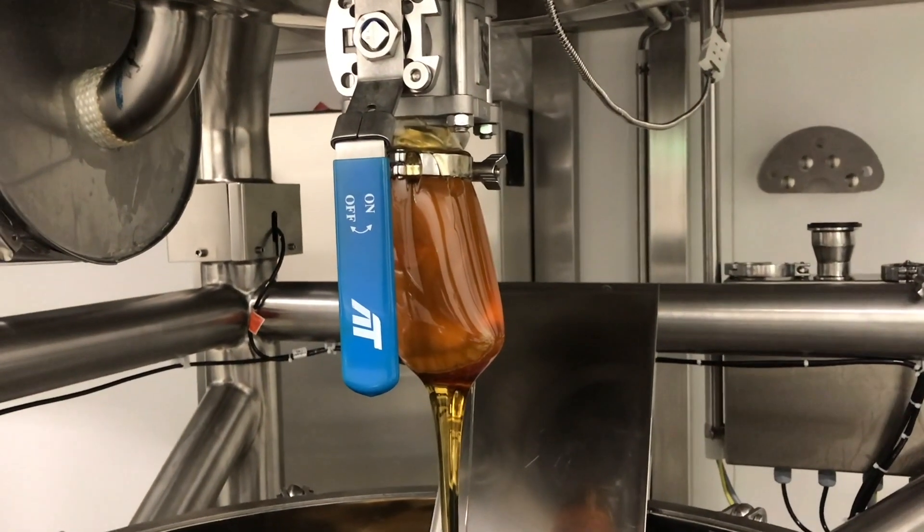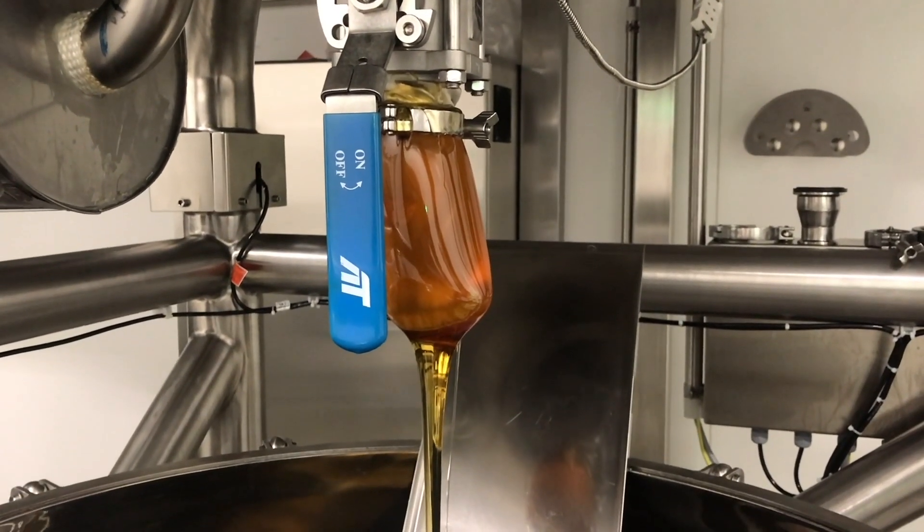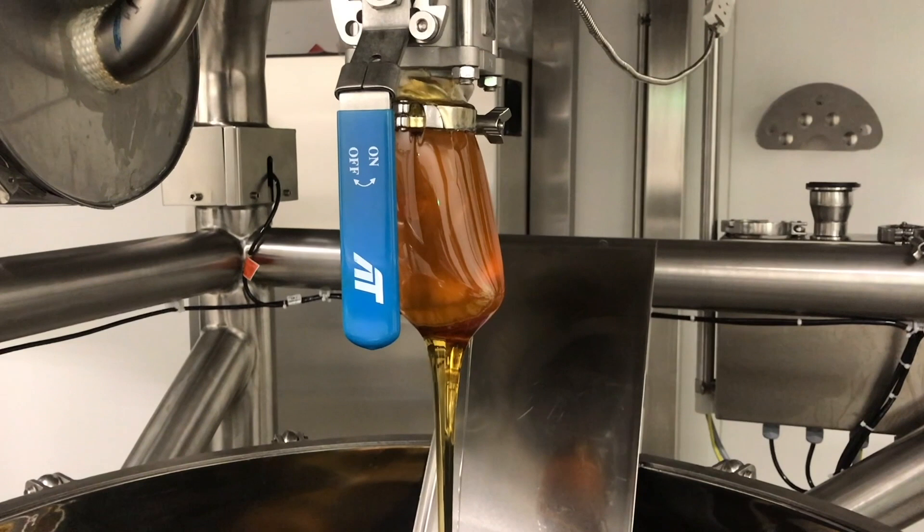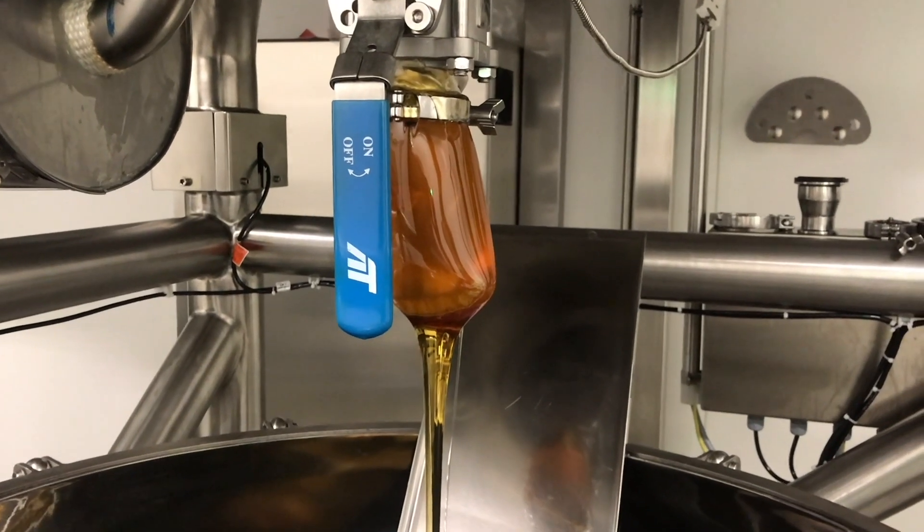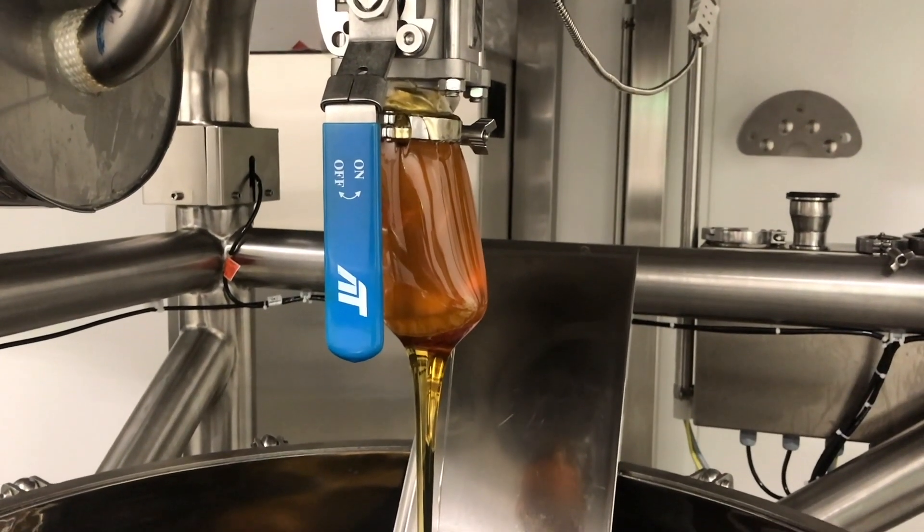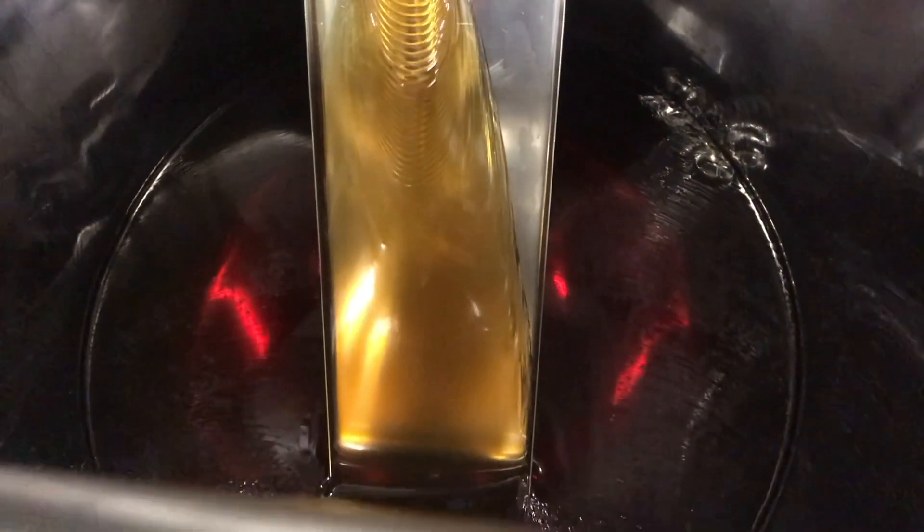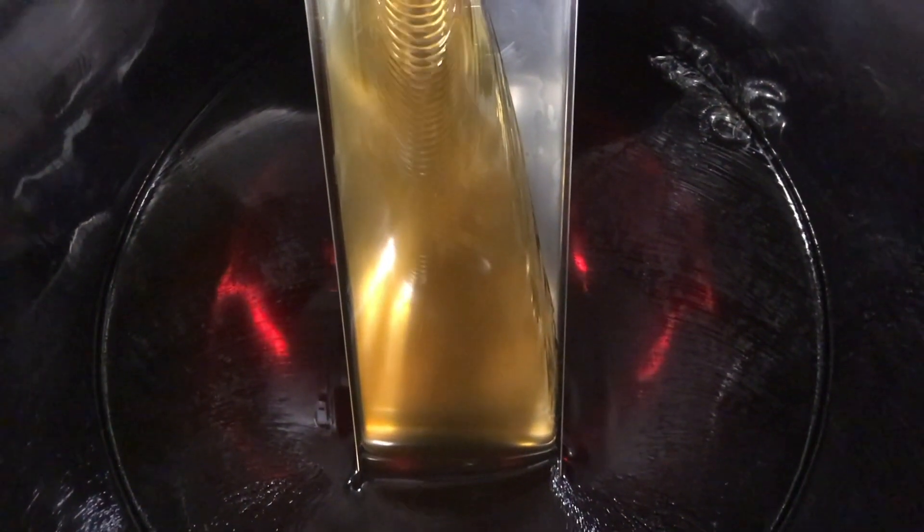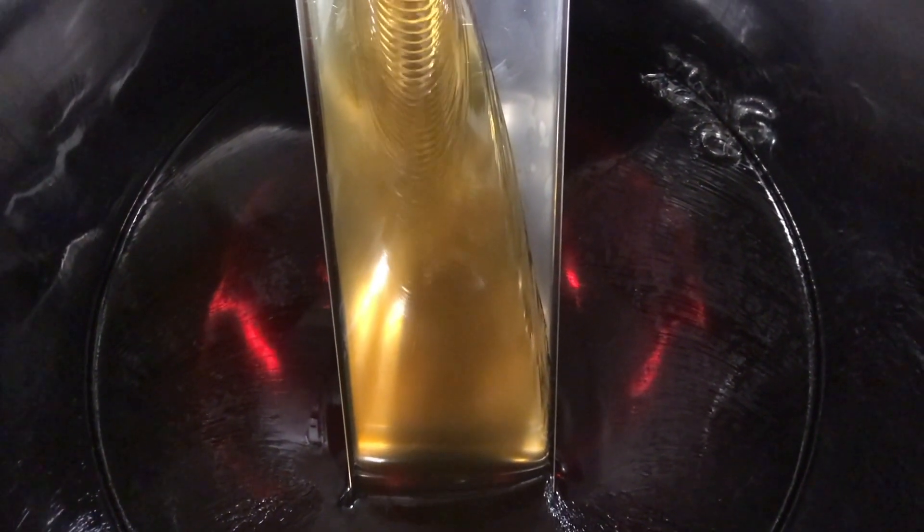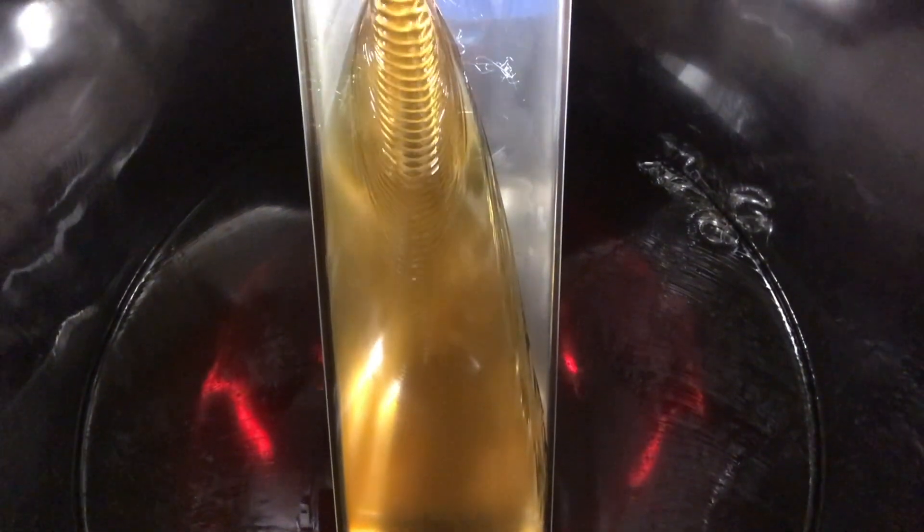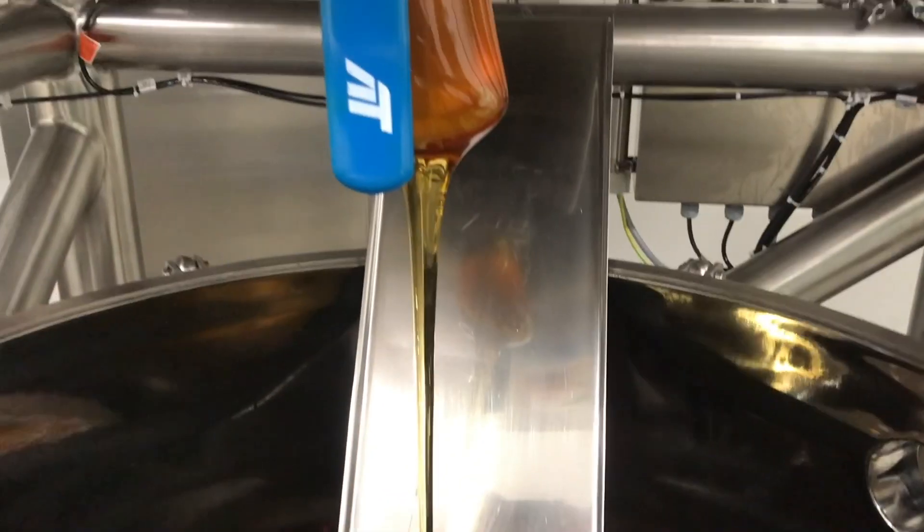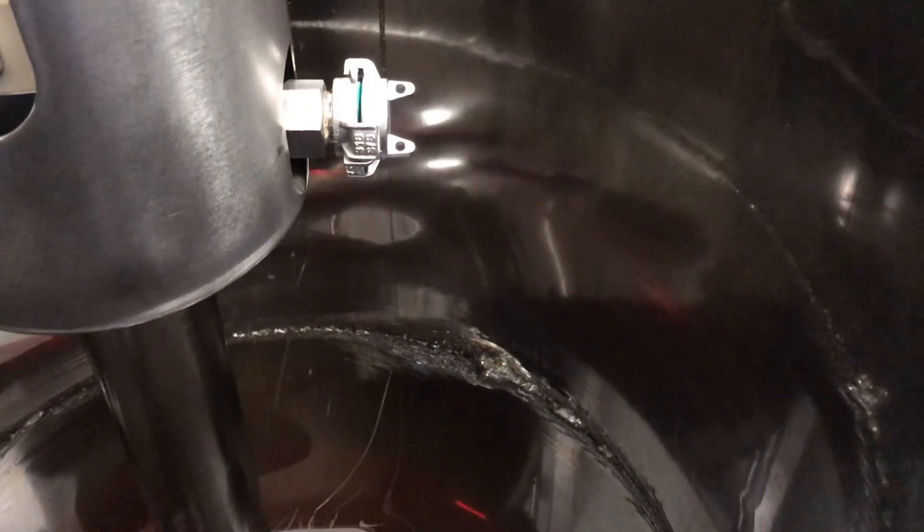In this video you see a real world example of a soft gel manufacturing process used in commercial products. This is the moment that the dissolved gelatin mass gets discharged into the holding tank. You see that it's very clear and doesn't have any bubbles in it. It's also quite hot at this stage, it has maybe 70 degrees.